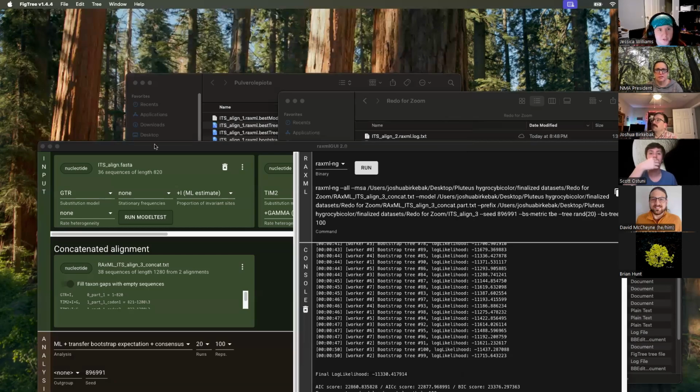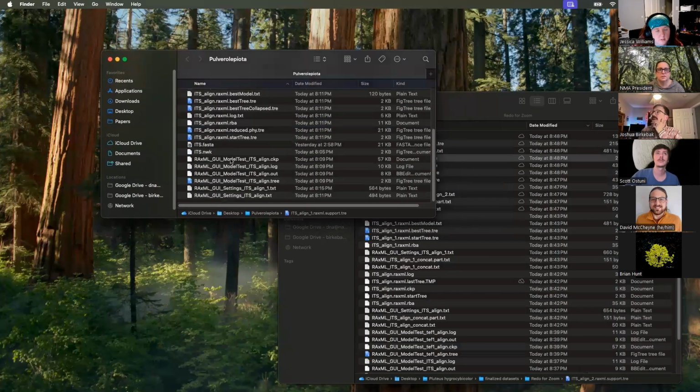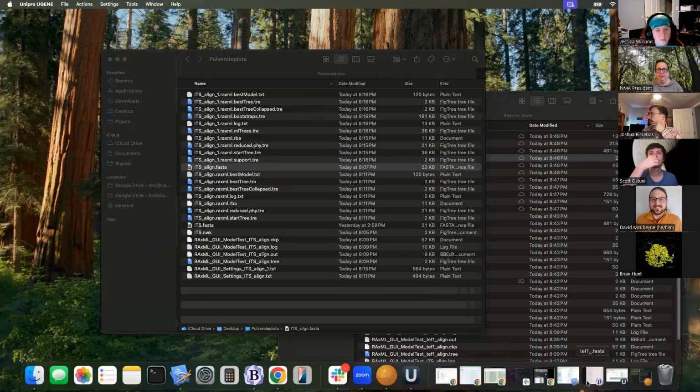I mean, I can go do this on my own later, but it would be interesting to see the Cystolepiotas without the combined haplotypes, or the Pulvera, that would be an interesting way to look at it. Do you have a data set without the haplotypes? I guess we could probably just do it here, right? Yeah, it's not a clean one. Let me go ahead and open this up, and we might just be able to delete out the ones that obviously are riddled with polymorphisms.